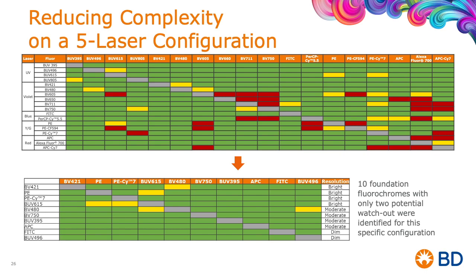There's no more red. There are only fewer spots in yellow that indicate potential impact due to spread. So really, we are starting from a better starting point. We minimize areas of challenges and minimize areas of potential mistake and loss of resolution.